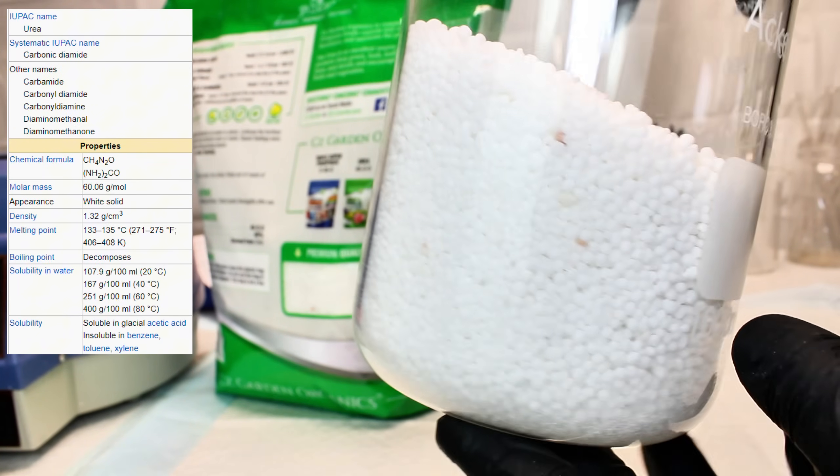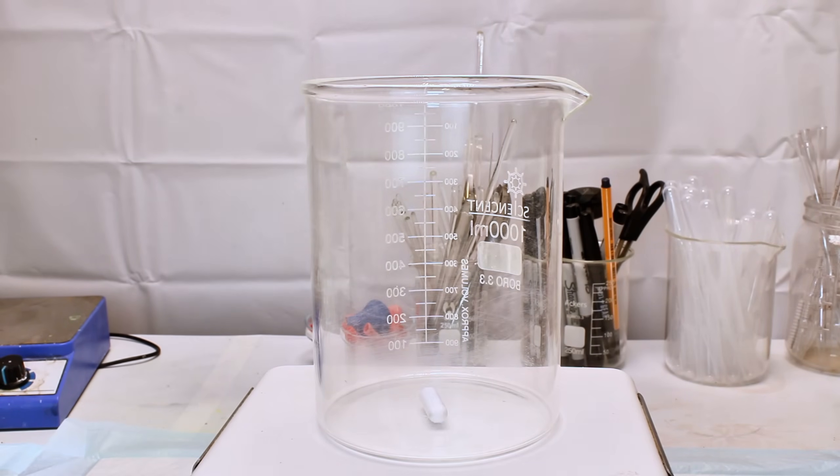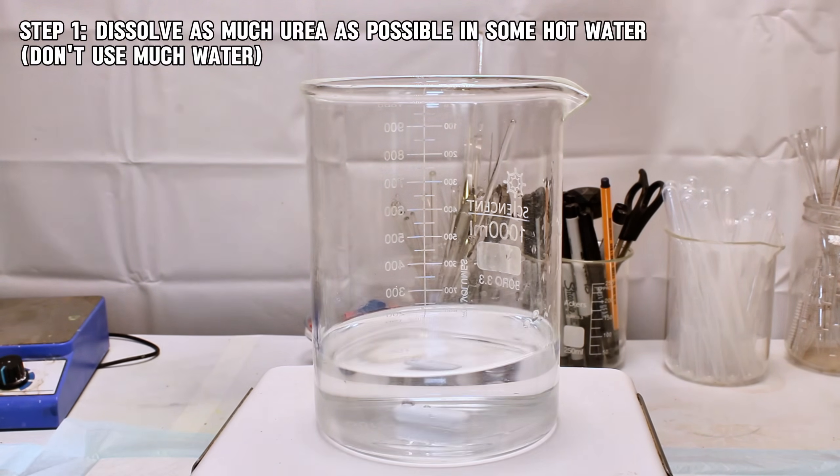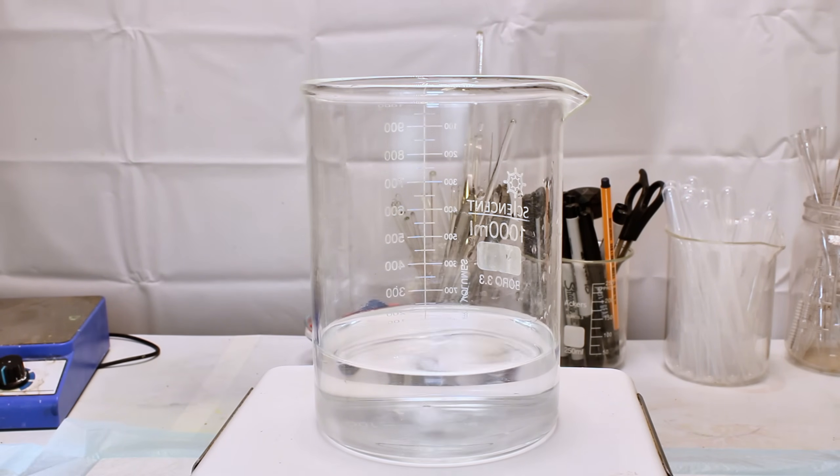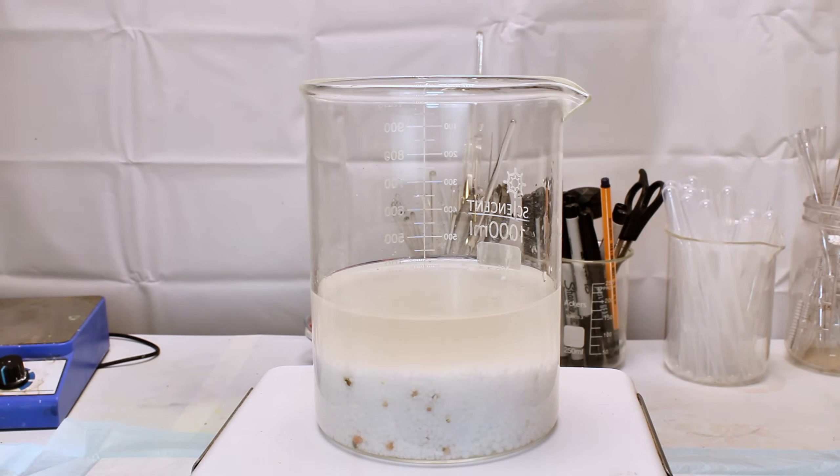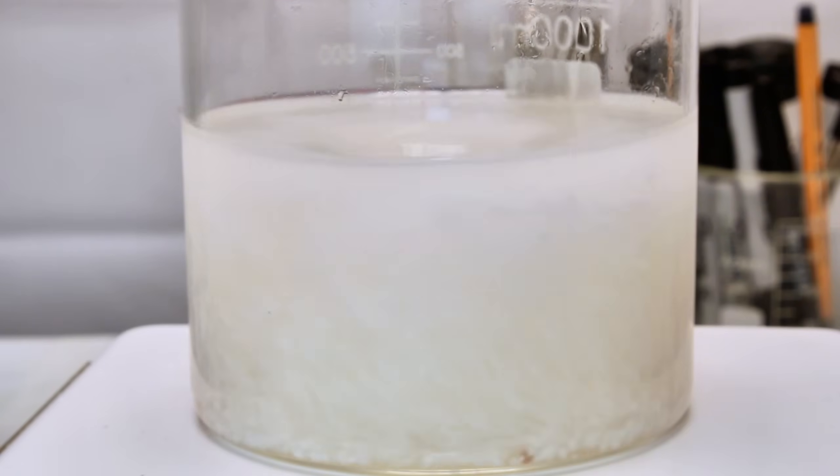To this end, the first step is to once again dissolve the urea in water, but this time I'll be dissolving as much as I possibly can in a fixed volume of water, which in this case is about 250 milliliters. To do this, I simply dump in a bunch of urea and heat it under constant stirring until it all completely dissolves.